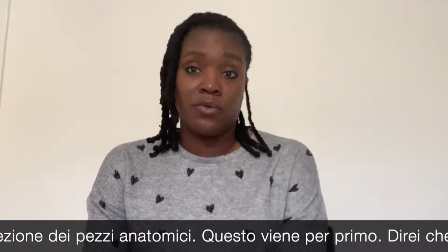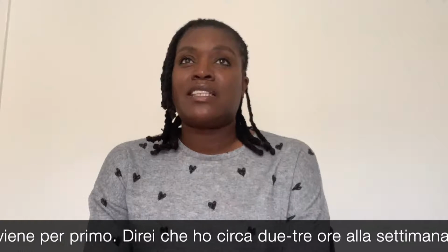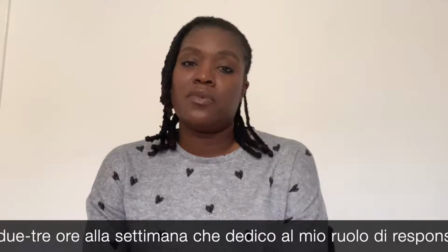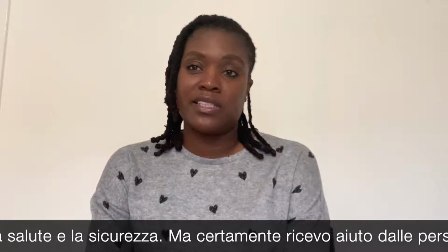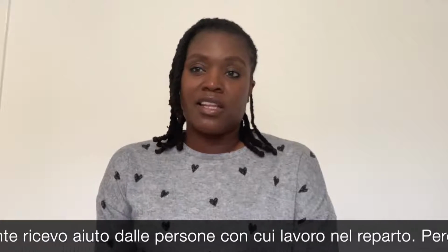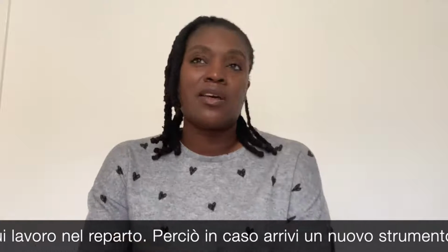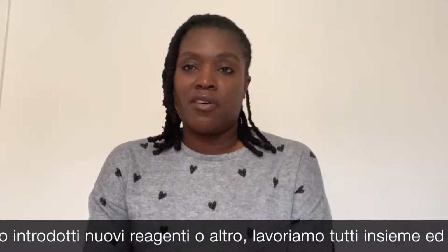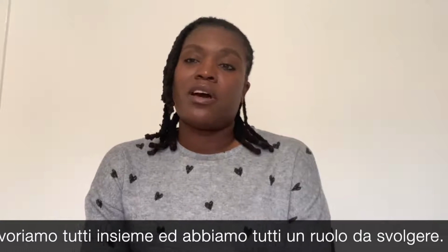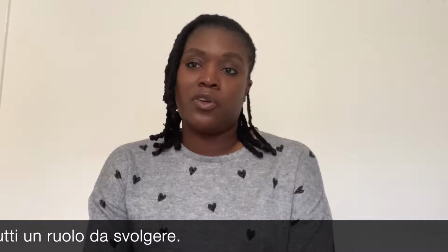I enjoy what I do, very much so. Dedication as in time, not really. My principal role is specimen dissection. That comes first, and then I'd say about 2 or 3 hours a week that I can dedicate to being the health and safety lead. But I do have help. There is somebody else in the department who we work together. So new equipment that comes in, new reagents and so on, we all work together. We all have a role to play.